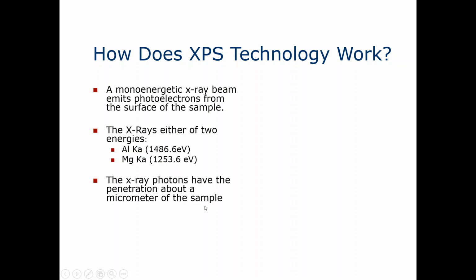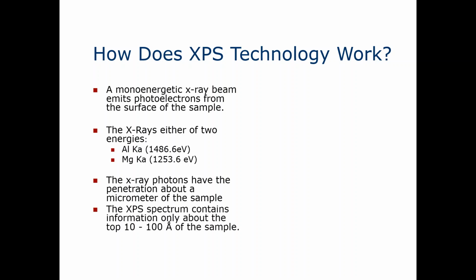The X-ray photons have a penetration length, the range up to which they can penetrate the sample, of about 1 micrometer.